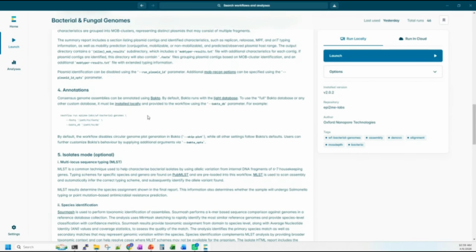And then the genome annotation, this one is used to identify the genes inside the genome. But this one, they have updated it to use the Bakta software. So based on my research, this software is used for bacteria or prokaryotic genome annotation. So that means if you are having fungal genome as your samples, this annotation might not be very suitable for your case. So I would suggest after the pipelines is done, after you get the full genome for your samples, maybe another round of genome annotation might be required in addition to this one provided by using the Bakta.